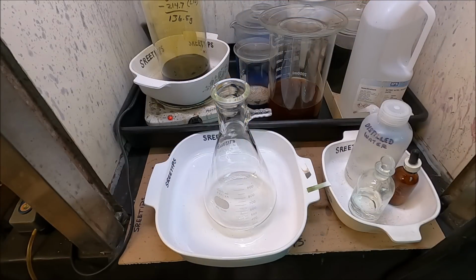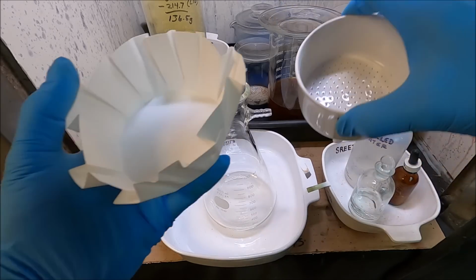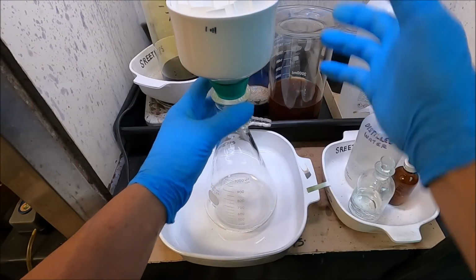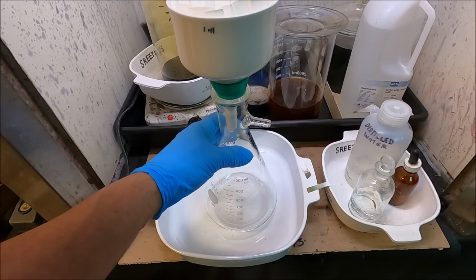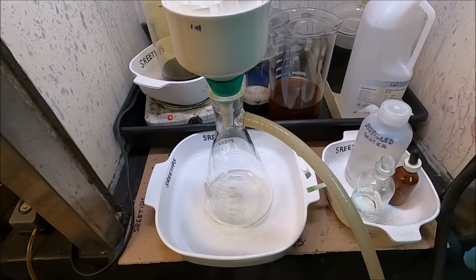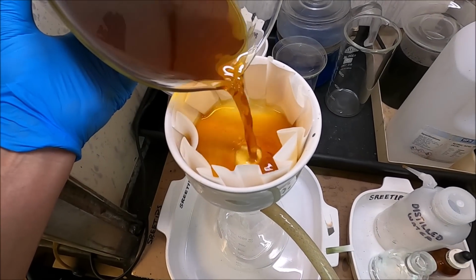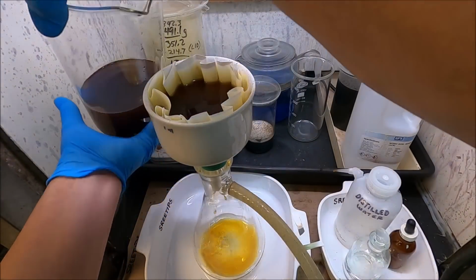Let's take a look at this big beaker here with our platinum group metals in solution. What I've got is another filter set up. I'll put it down in this funnel, and we're going to filter the gold that we just precipitated out of this solution. We'll get the platinum group metals in solution in a flask and the gold up here in the filter. Here we go. I need to turn my vacuum on. Let me get this started first. Filtering out the gold that we just precipitated out of this solution.